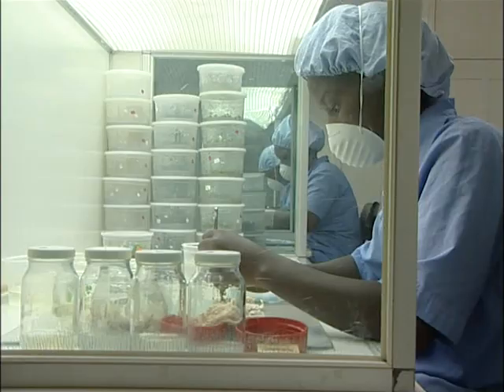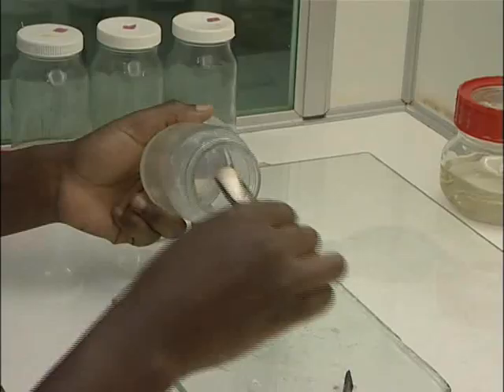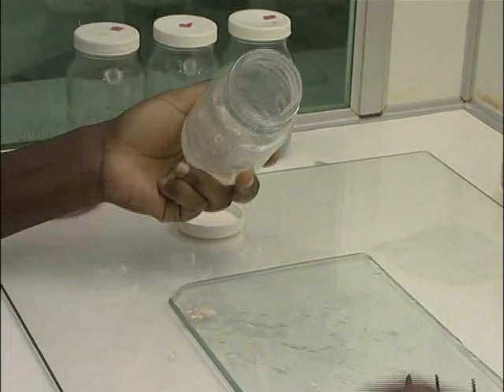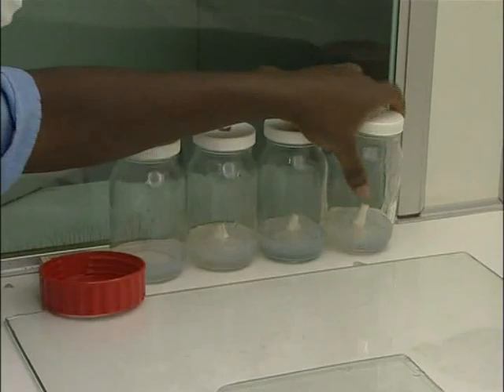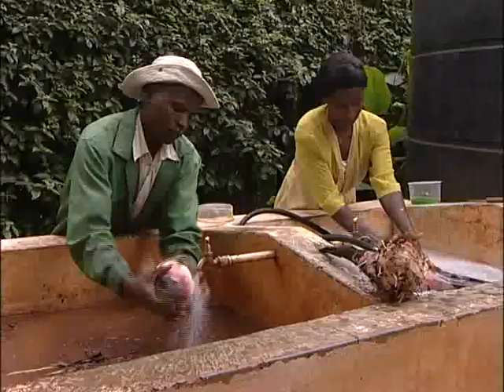With tissue culture techniques, you get the tissues of the plants, take them through the laboratory and they multiply themselves through some media — they're given some food — they multiply themselves, and you actually get the same original material that you had before.